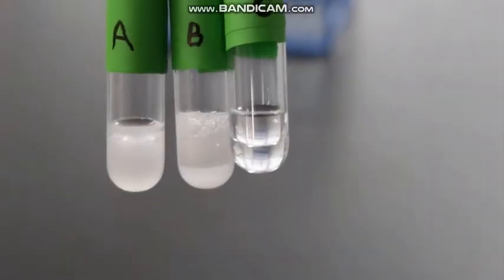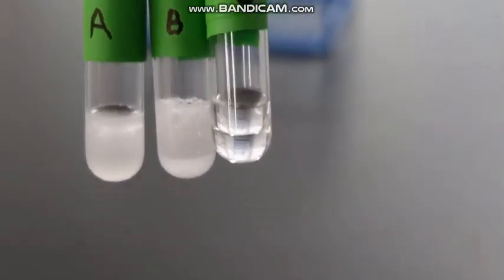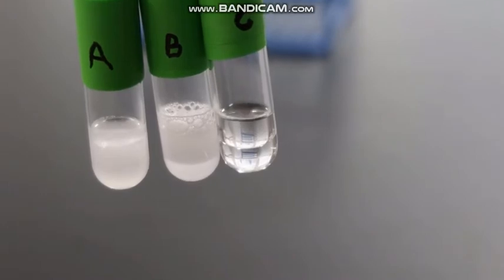It might be a challenge to see the difference between these test tubes. Look closely to see if you see separation between the solutions in the test tubes.